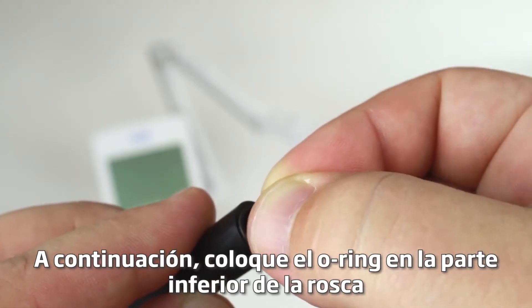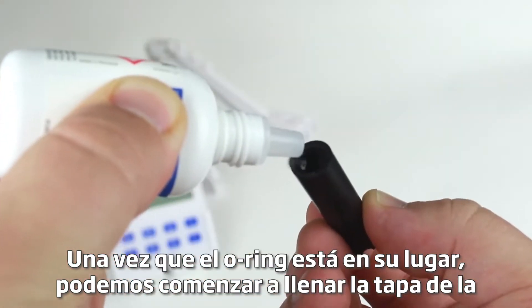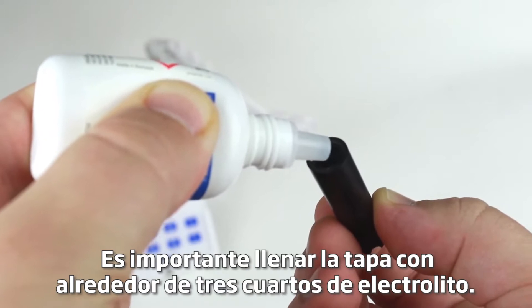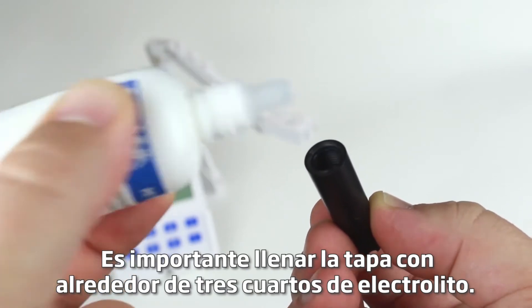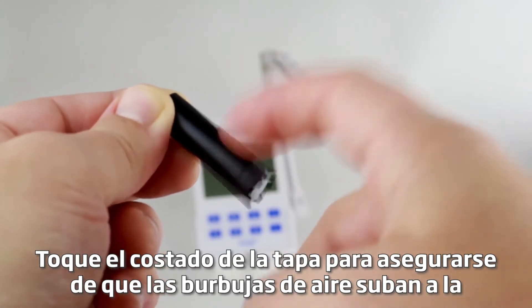Next, position an O-ring at the bottom of the threading for the membrane cap. Once the O-ring is in place, we can start filling the membrane cap with electrolyte. It's important to fill the cap about three-quarters with electrolyte. Tap on the side of the cap to make sure that any air bubbles rise to the surface.